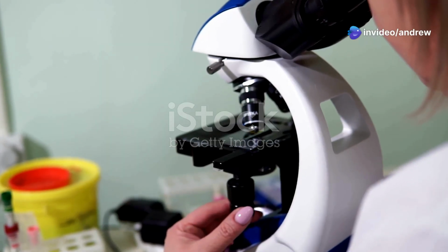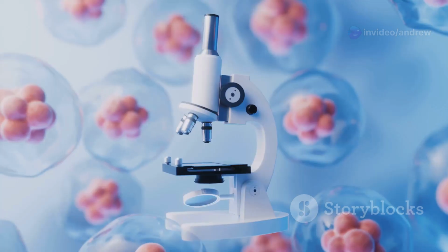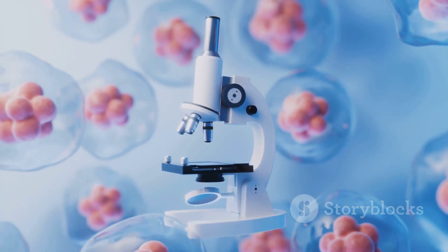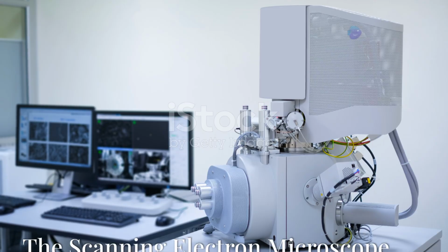TEMs are used in a wide variety of fields, including materials science, biology, and medicine. For example, TEMs are used to study the structure of materials, the function of cells, and the causes of diseases.